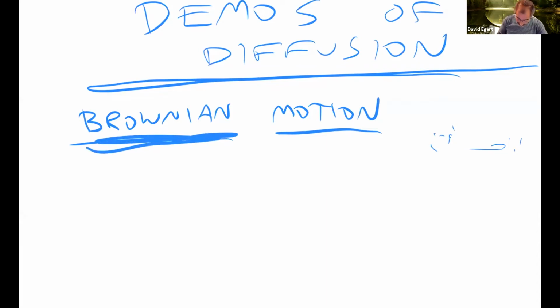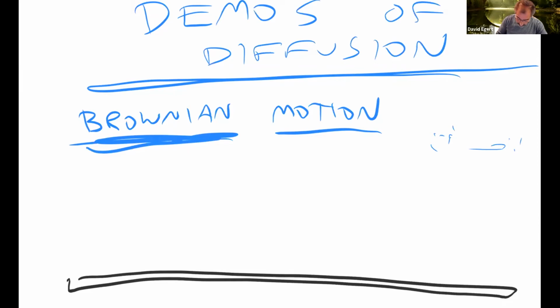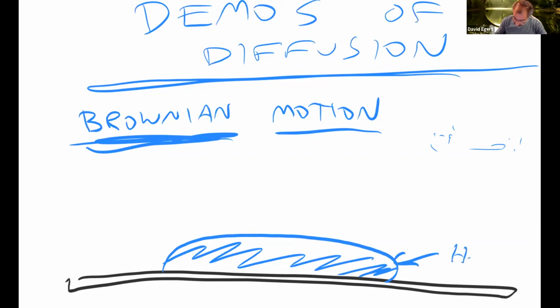The basic idea is, usually you have a microscope slide and you put a drop of water on there. And then you put something really small and light on it. In this lab, we use tiny little crystals of carmine dye, which you could think of like little red rocks. They're easy to see, but they're dinky. When I was a kid, the first time I ever saw Brownian motion was with pollen grains sitting on a drop of water.